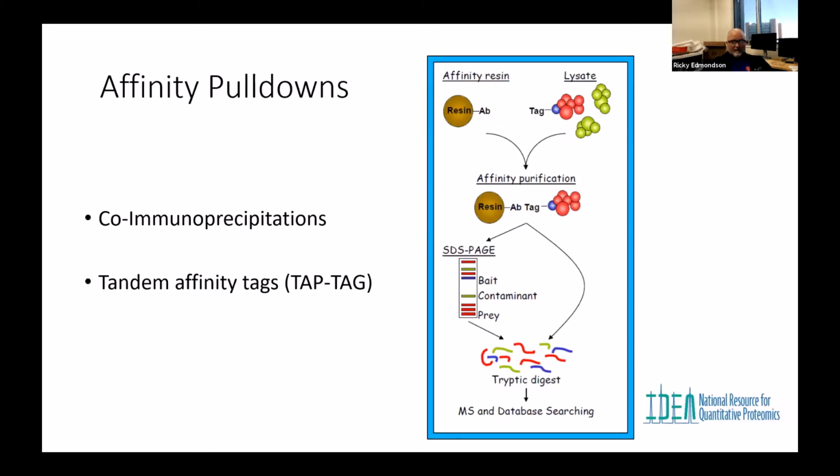And so it wasn't a problem if it pulled down some non-specific things, because you had a fairly specific antibody to pull down, a sensitive antibody anyway, and then you were probing with another antibody that was fairly specific. So you wouldn't want to look at a stained gel from an affinity pull down, but you look at it by Western on the three proteins that are interacting with it, and it looks pretty good.